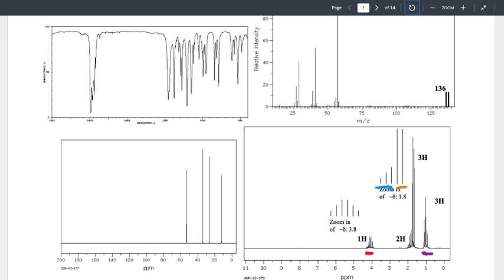So I can encounter situations where I get tons and tons of symmetry. It's just less likely and it's harder to manipulate. You now have a whole lot more pieces floating around. So when you're going through and doing your integration interpretation, try and pick the simplest interpretation possible. It is easier to have 3 hydrogens all bonded to 1 carbon than to have 3 carbons all with 1 hydrogen connected to them. Does that make sense?